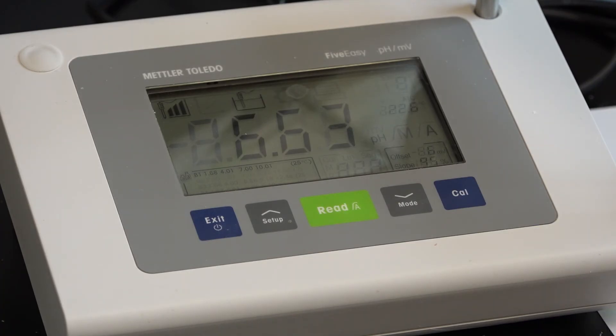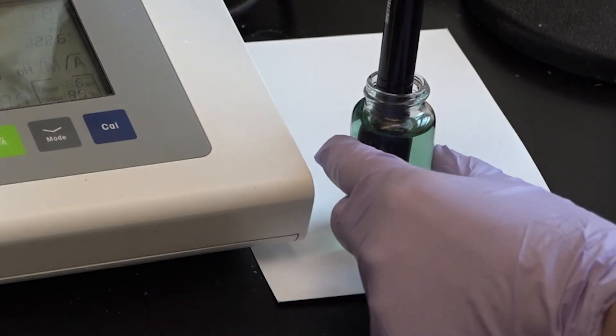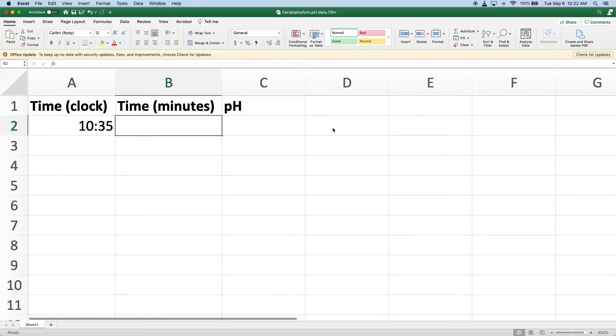Okay, a little less than 7 but still green. I'm going to put this back in the light and we'll take additional pH readings throughout the experiment, entering the time and pH value of each measurement in a spreadsheet so we can plot the data later. Unfortunately, every time I open the vial to take a measurement, I will let some carbon dioxide gas in, so my readings will be a tiny bit off from the vial that's staying closed the whole time, but it'll still show a useful trend. I can't do this with the vial that's in the dark because exposing it to light would super mess up the treatment, but we'll measure its pH at the very end of the experiment.